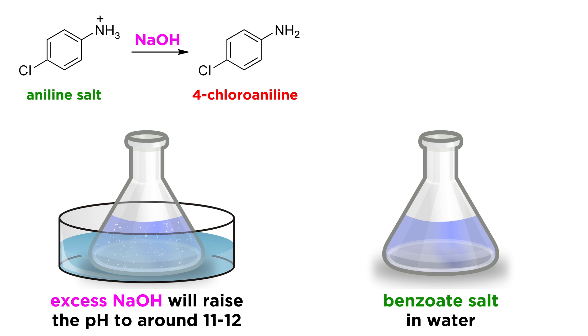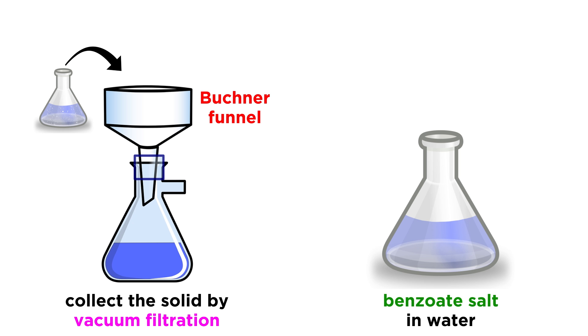Now that we have our solids sitting at the bottom, we can just set up a Buchner funnel, hook it up to a vacuum pump, pour the solution onto the filter paper sitting in the funnel, and wait for it to dry.